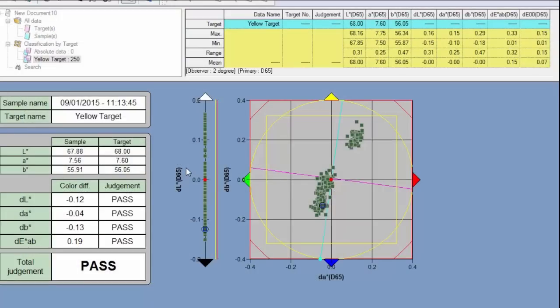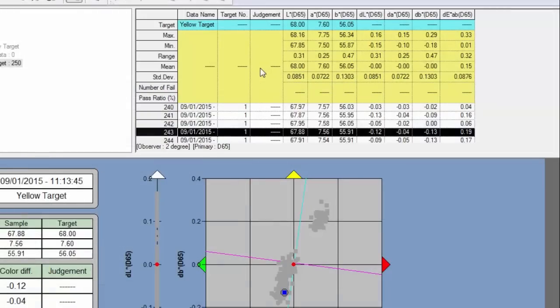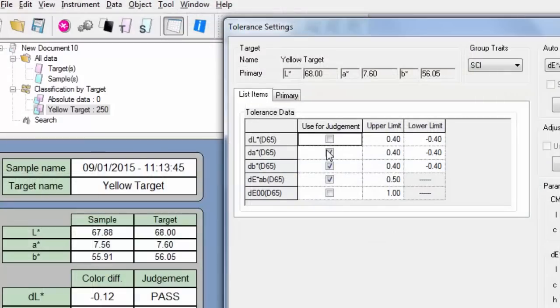Create virtual targets by averaging a range of samples. Tolerance settings and various search functions allow you to set up conditions that quickly extract the closest color match.